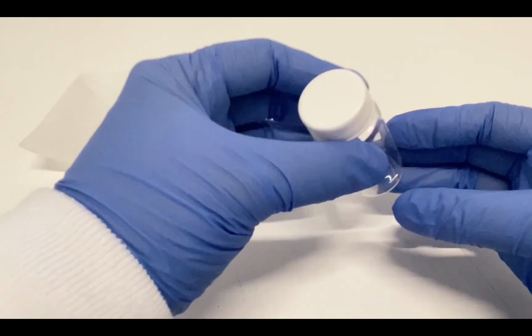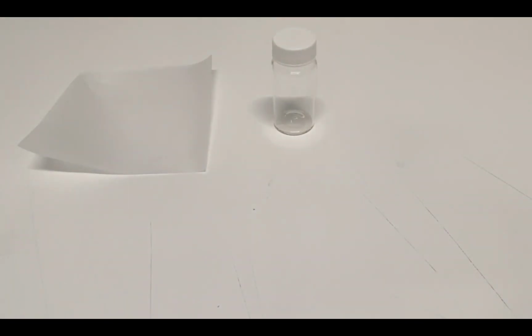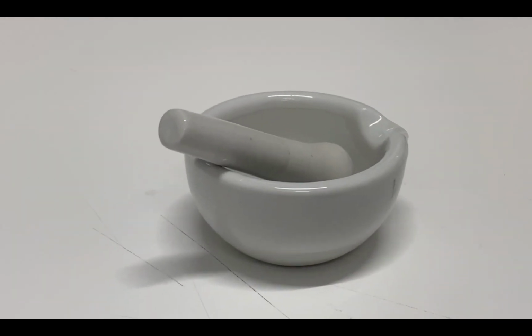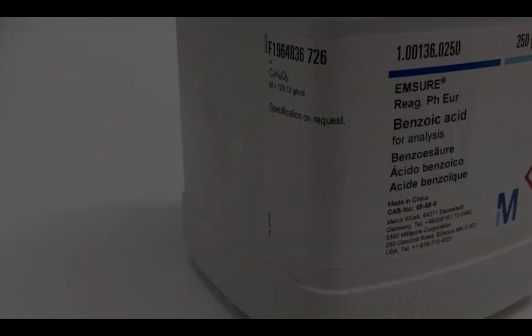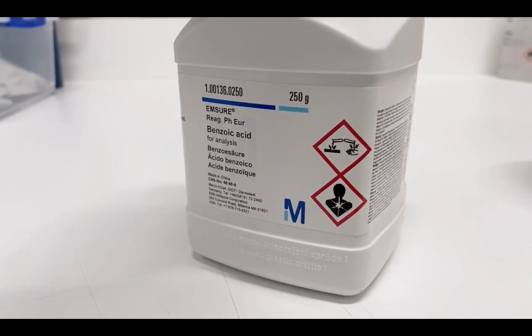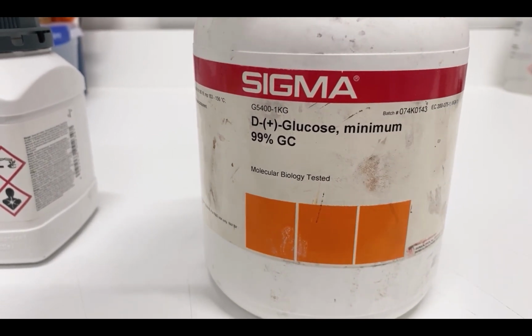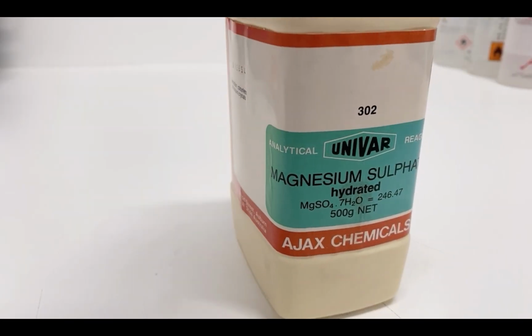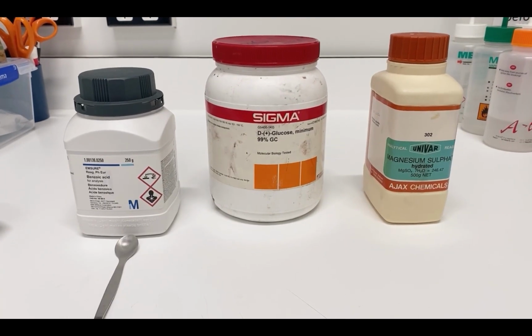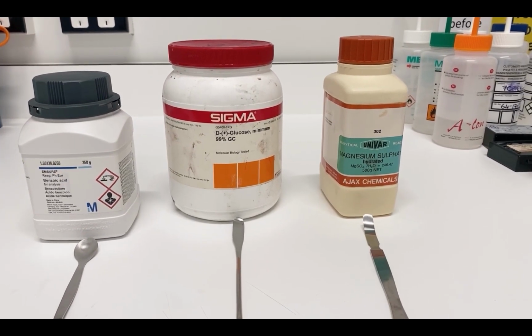We'll also be using vials. This small container is perfect for holding and mixing our solid mixtures. Next up, mortar and pestle for grinding and mixing our solid samples into fine powder. Our solid samples include benzoic acid, glucose, and magnesium sulfate. Make sure to use a clean and unique spatula per sample to avoid cross-contamination.